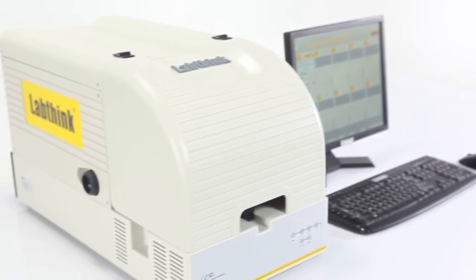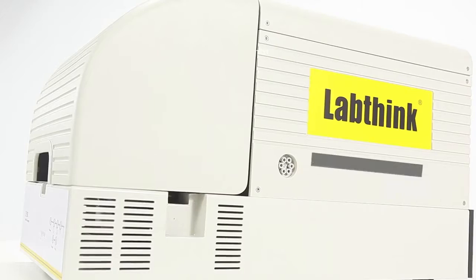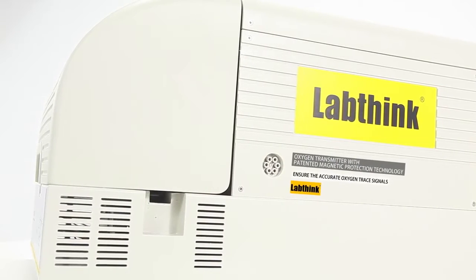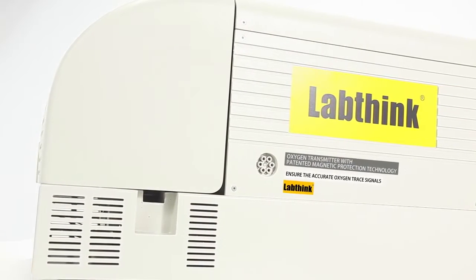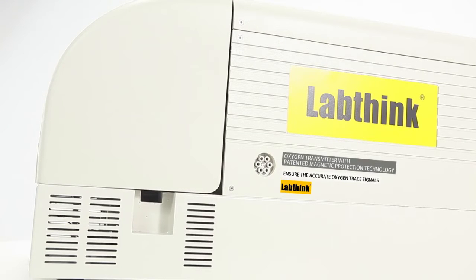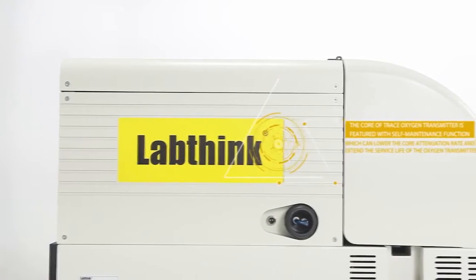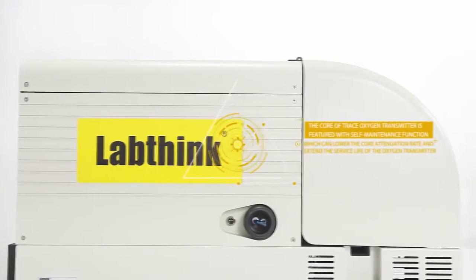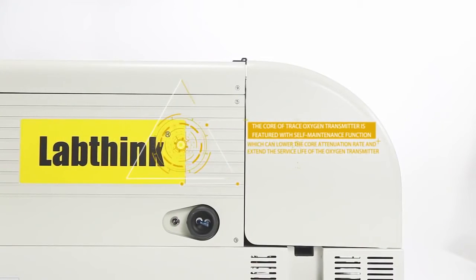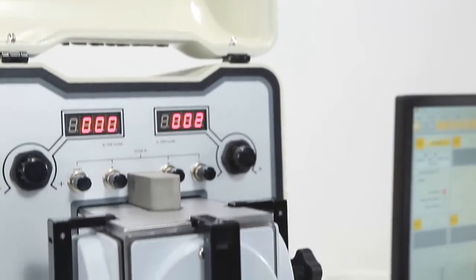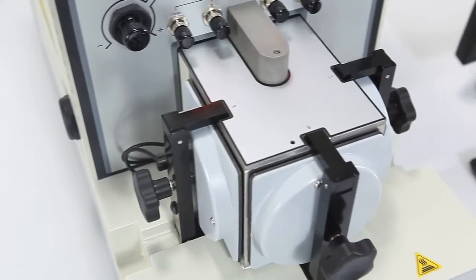C230 uses a high precision trace oxygen transmitter with patented magnetic protection technology, which can insulate external electromagnetic interference to the sensor and ensure accurate oxygen trace signals. The core features self-maintenance function which lowers the core attenuation rate and extends service life. C230 is featured with Labthink's innovative core control technology, enabling high resolution and sensitivity oxygen testing.